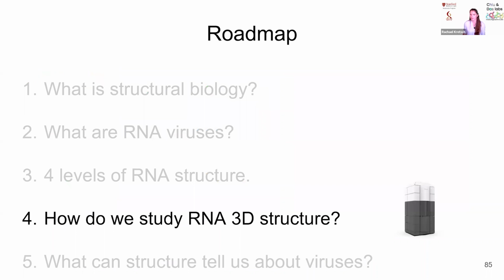All right, so let's focus on how we get the shape first of all. And that's really done through Cryo-EM right now. At least that's what we do at SLAC.